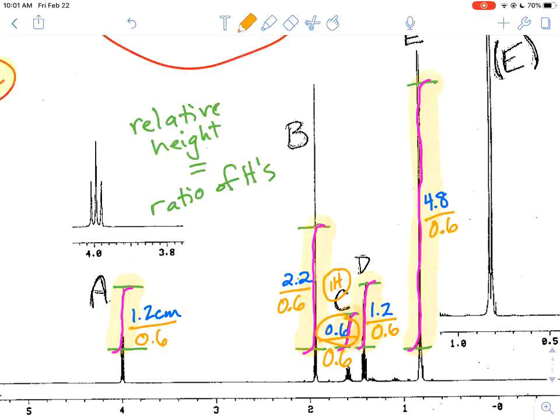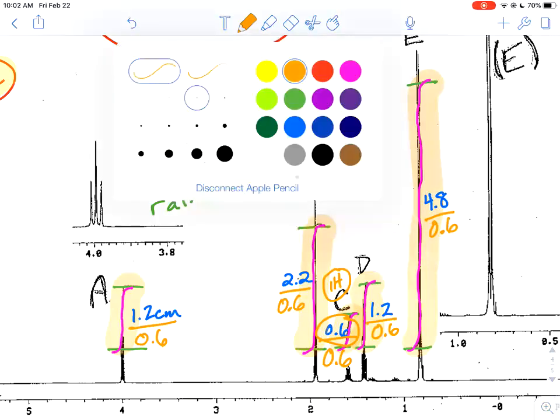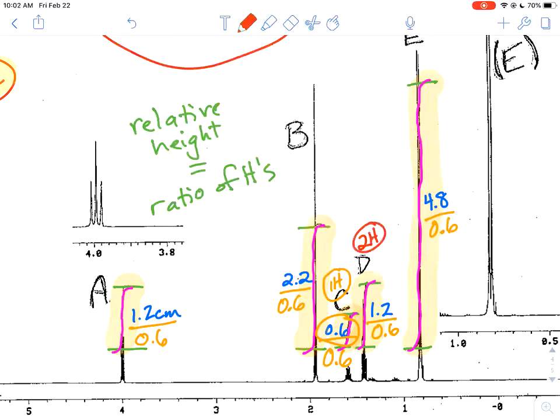So you divide each one by 0.6, and that's going to give you a relative ratio for hydrogens. And so for signal D, it comes out pretty clean. I'll just do that one next to two hydrogens. Signal B comes out pretty clean to three hydrogens. 2.2 divided by 0.6 is about three. Actually it's 3.6, but at this point we know that we know what the structure actually is. So sometimes we do have to do some guesstimation there or rounding to make it fit the structure. Signal A is pretty clearly two hydrogens. And then lastly for signal E, 4.8 divided by 0.6. Actually, I think this one comes up to something funny too. This comes up to about eight hydrogens, but we know that we can't have eight. It must be a six hydrogen signal. Definitely a little bit of hand waving going on there with integration.